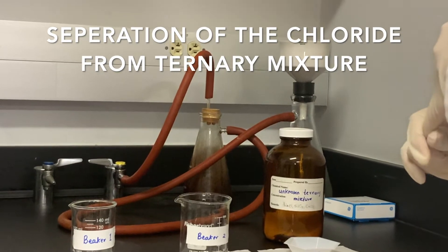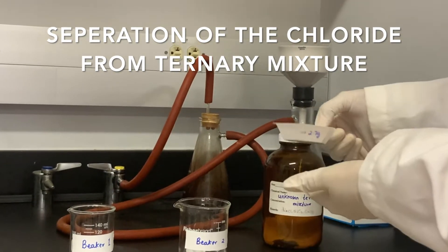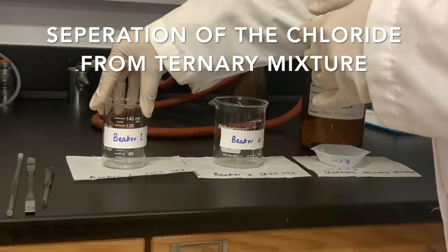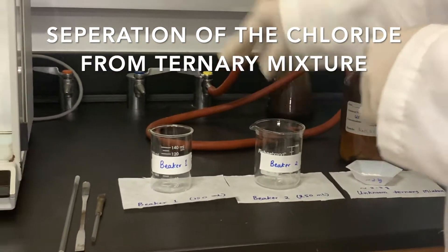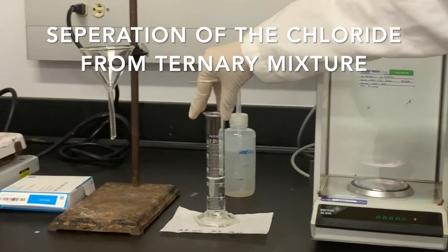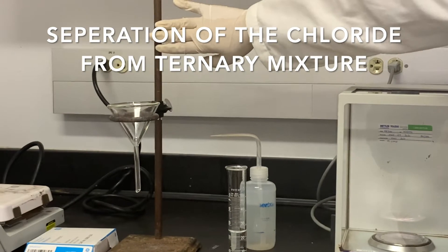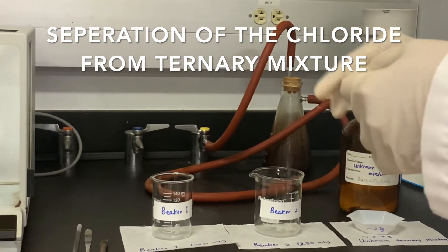In the first part, I'm going to separate the chloride. For this, I have approximately 2 to 3 grams of the mixture. We need the 150 milliliter beaker, the 250 milliliter beaker, the analytical balance, 25 milliliters of DI water, and we are going to do gravity filtration. This is the gravity filtration assembly. First, I'm going to weigh the empty beakers.